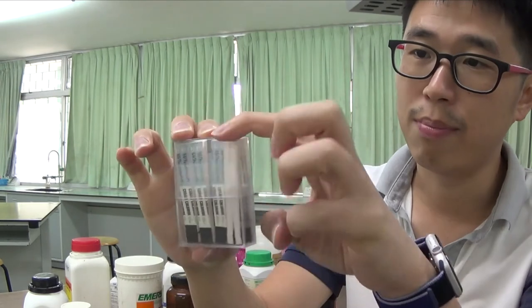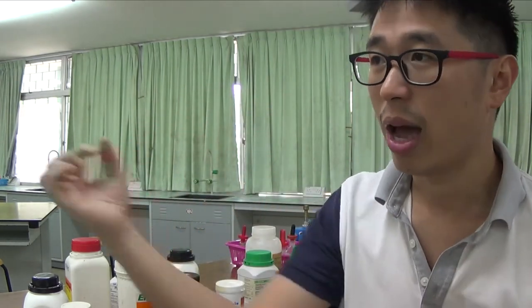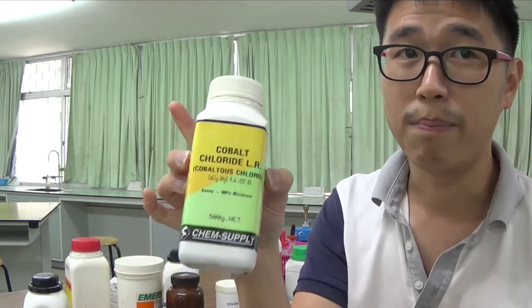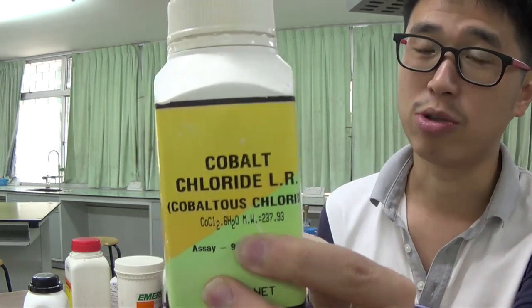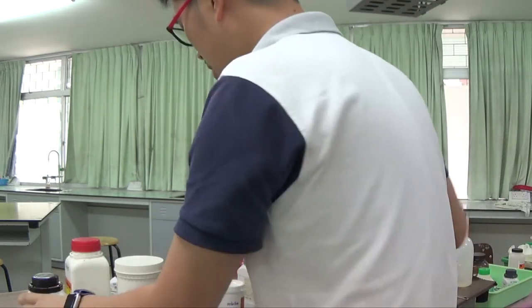It will become blue, and they actually use it to coat the filter paper. When you have water in contact with the blue cobalt(II) chloride, it will turn pink again because it will form the hydrated compound again. Anyway, I'll show you that in a little bit. Let me start off with something simple.